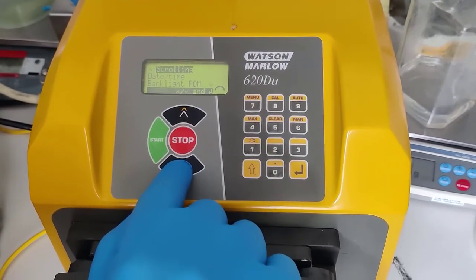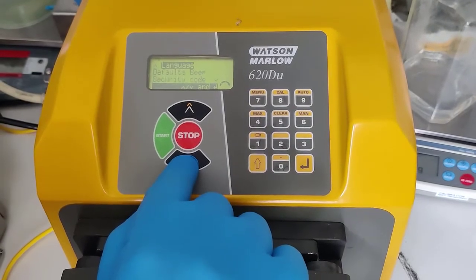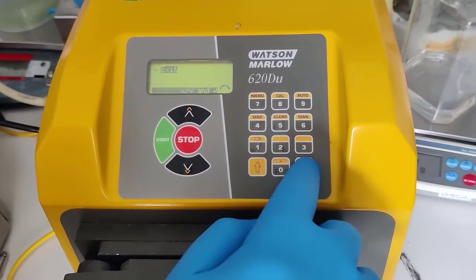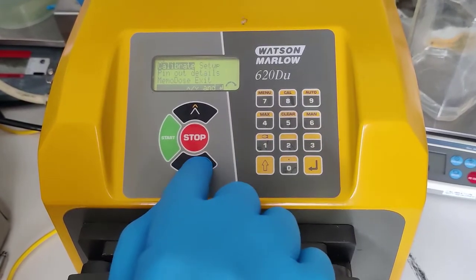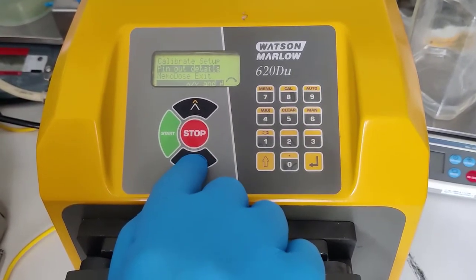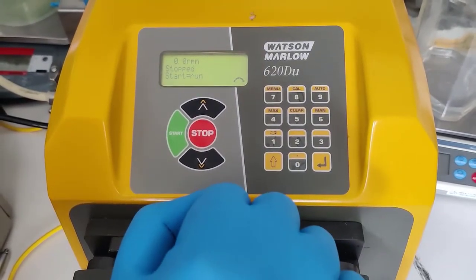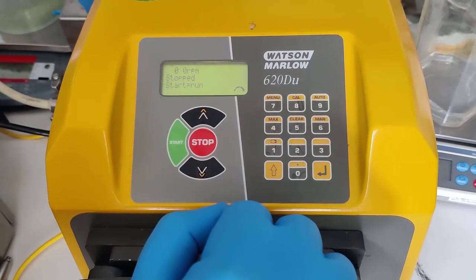Those settings should remain at default. Scroll down to exit, then exit. So that sets up the parameters for remote control.